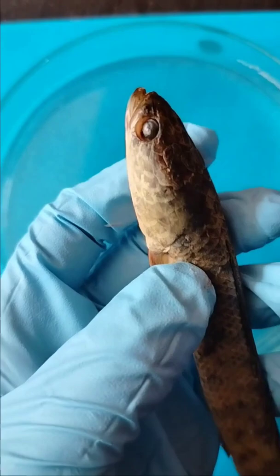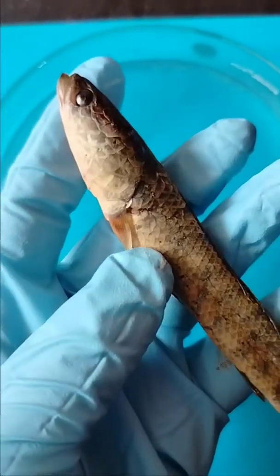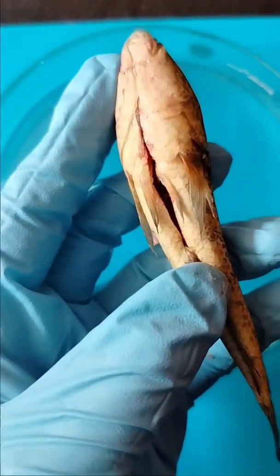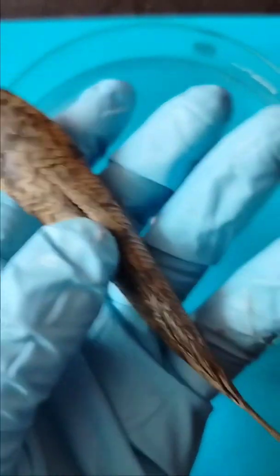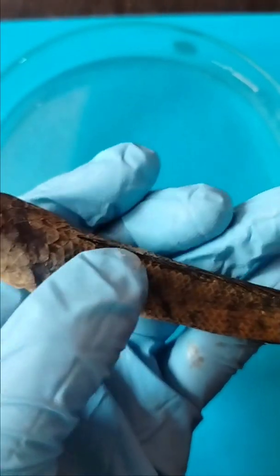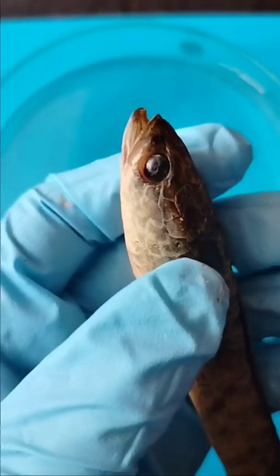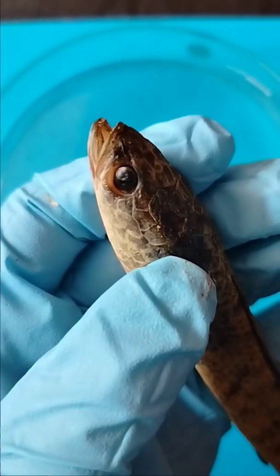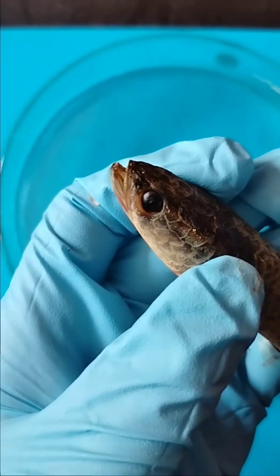I want to dissect its head so that I can remove its brain with the help of my scissors and other equipment related to my dissection procedure. The head of the fish is bony and flat in structure and is highly ossified, so I use sharp and pointed scissors and pointed forceps to remove its flap and the tissue slowly without damaging the brain.